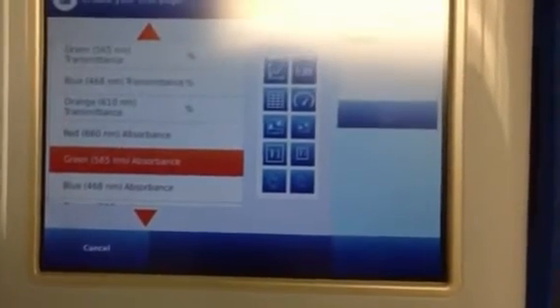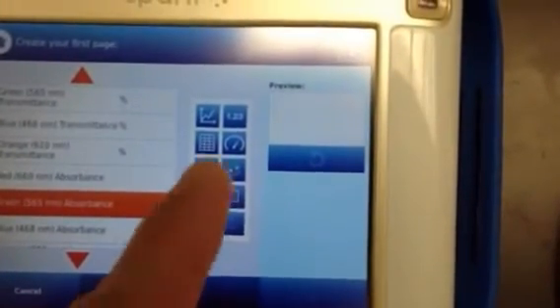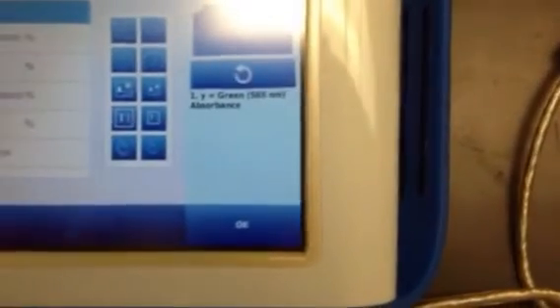Once you have that, you're going to click on the graph button in the upper left-hand corner. There are some choices there, and you can see it's going to graph the green color on your y-axis. Time will be on your x-axis, and you're going to click OK.